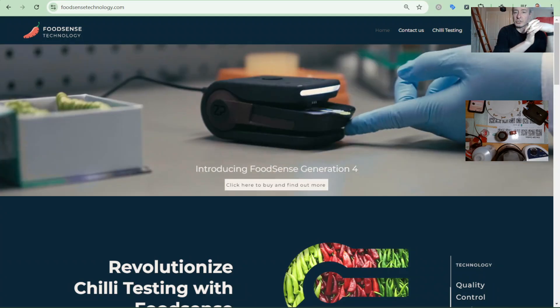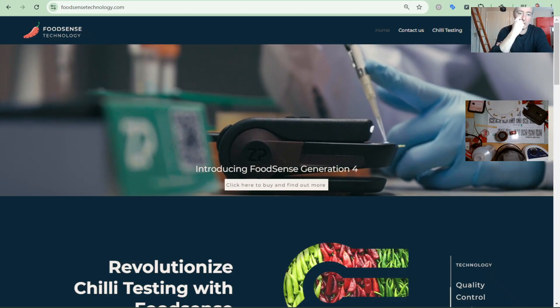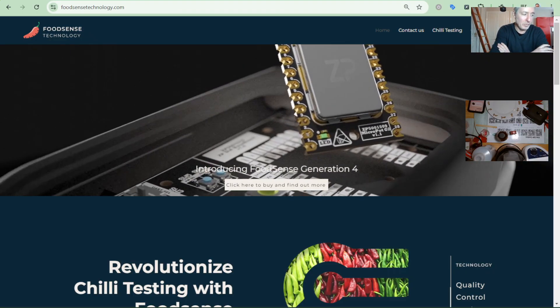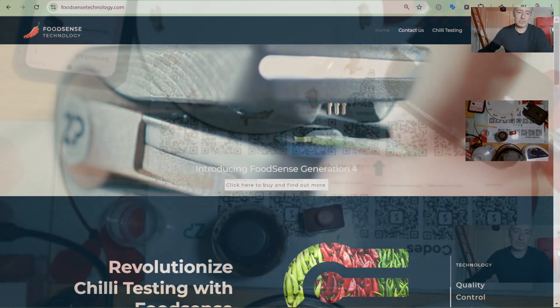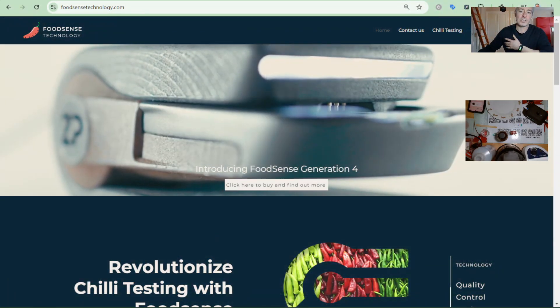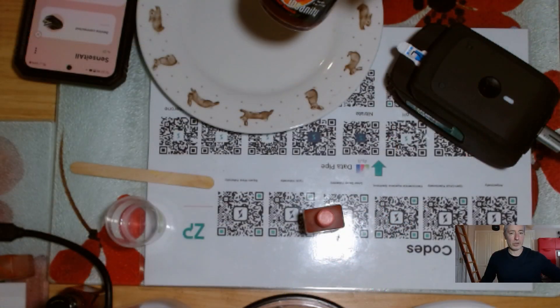Hi, I'm going to check on the technology stack at ZP by doing a measurement of something quite familiar to us at ZP — or Food Sense I should say — and that's measuring the hotness of a product called The Bomb.